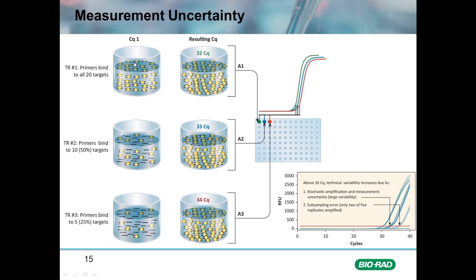This is measurement uncertainty. If all target molecules amplify in cycle one in a technical replicate, there will be a lower CQ than if fewer target molecules amplify, shifting the CQ values higher. In qPCR, the only way to circumvent this problem is to use more technical replicates when the CQ values are above 29 to 30 cycles, and then take the average CQ value of those replicates.